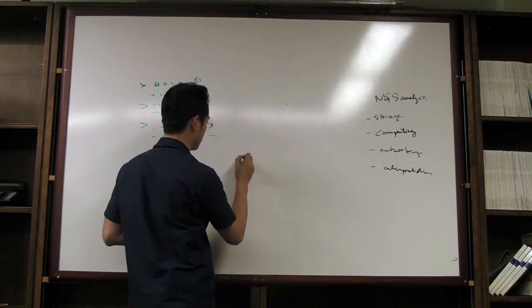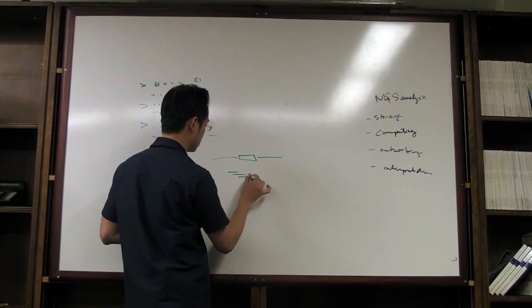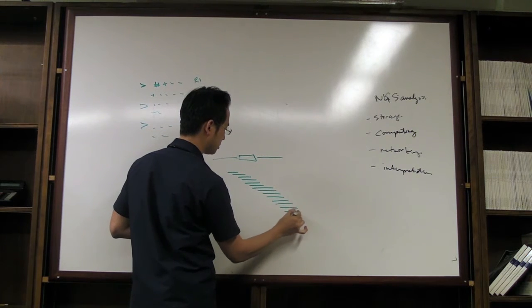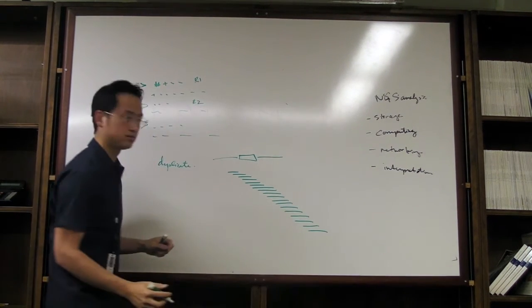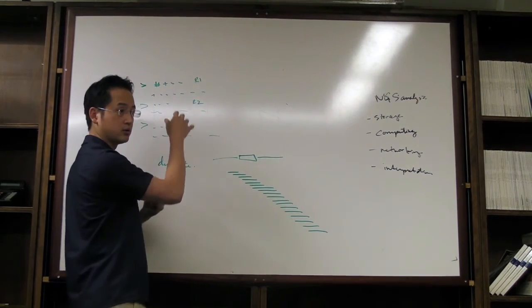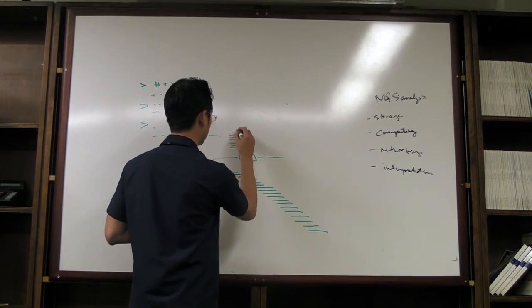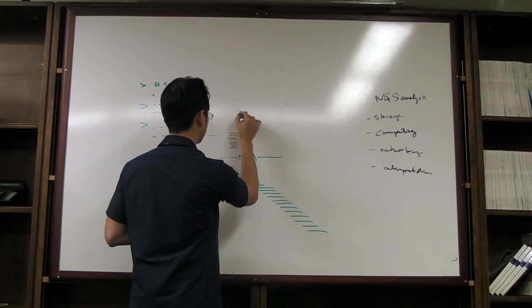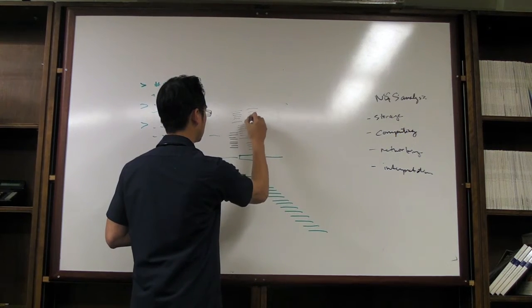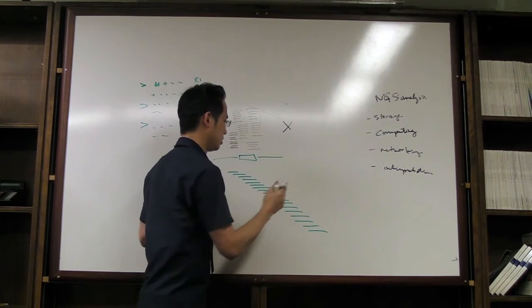So you want to check, let's say this is where you're targeting something, right? You want to make sure that your sequencing is starting kind of randomly and ending randomly, like that. Whereas a bad run, let's say we do whole exome capture or the 500 gene capture. Let's say you have things like this. They're always starting on the same site. This is an important concept because this is what you don't want. This is what you do want.